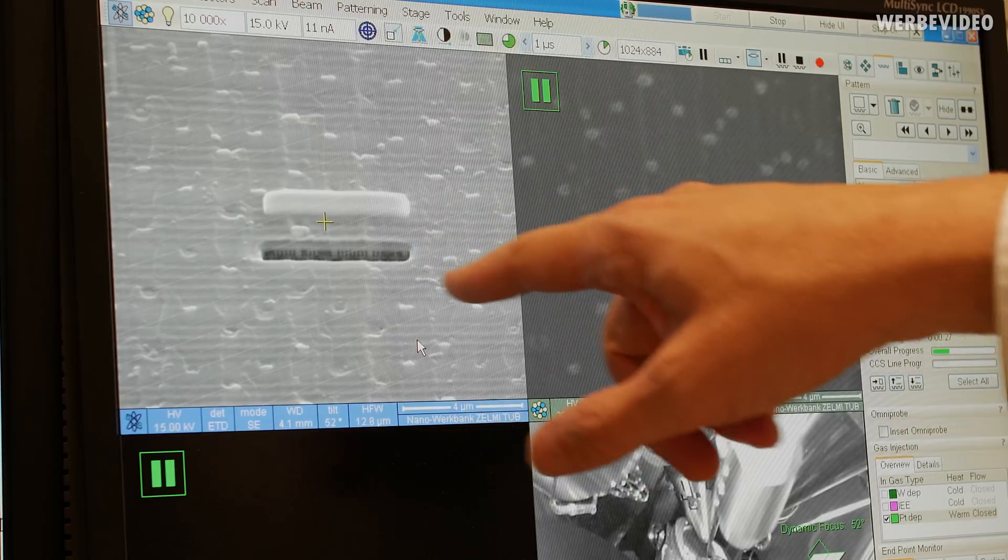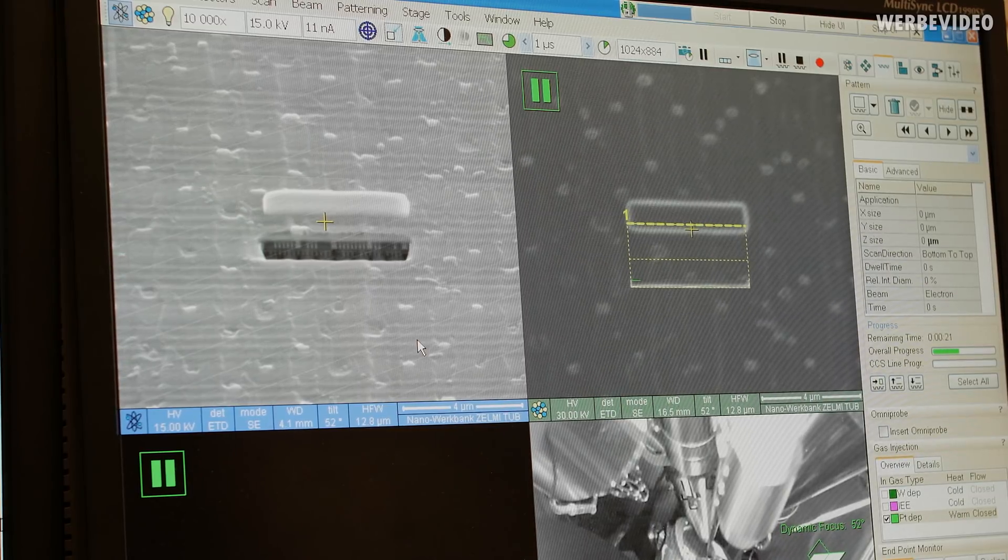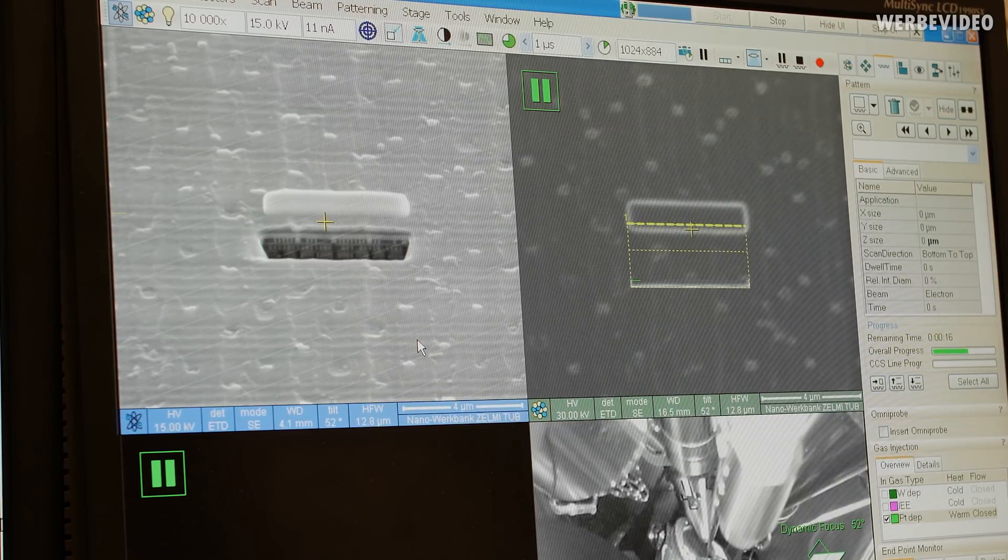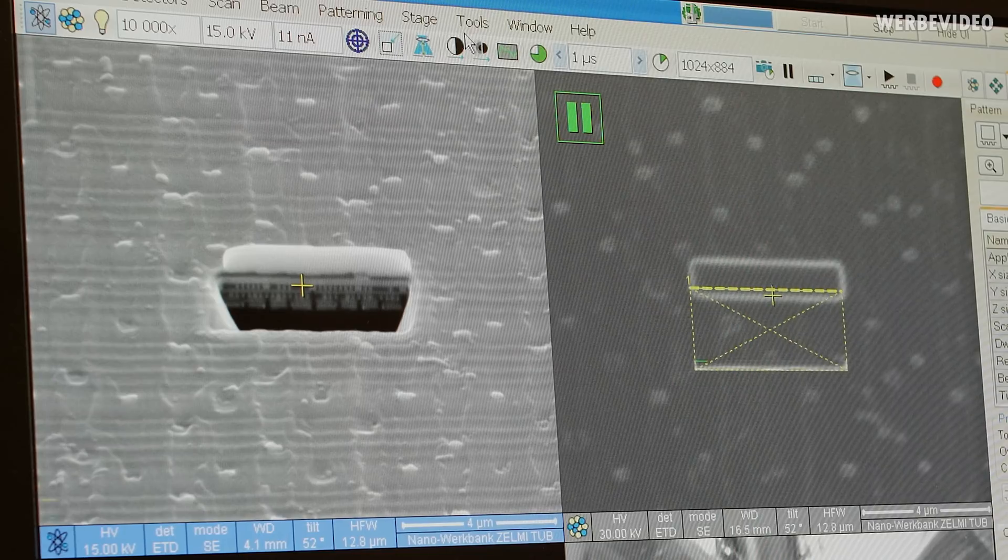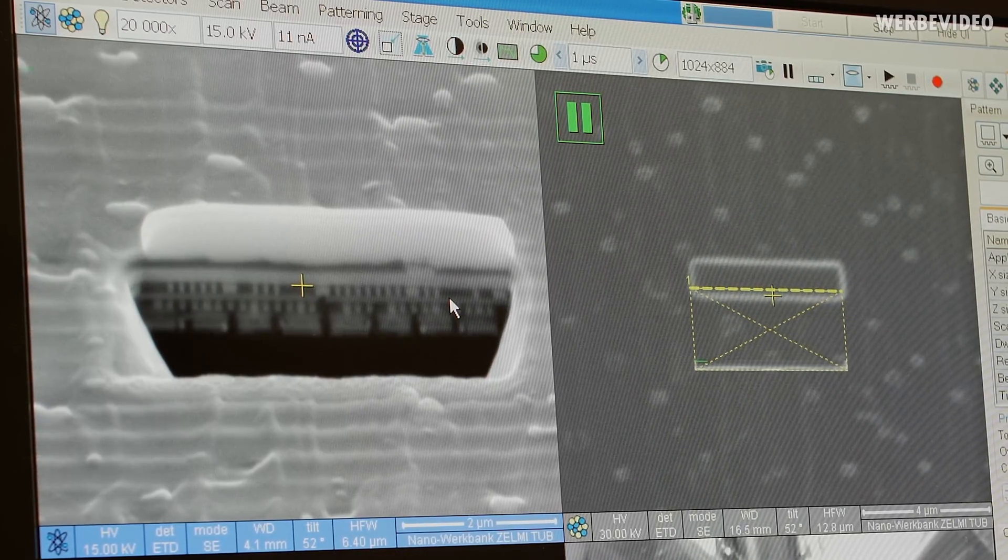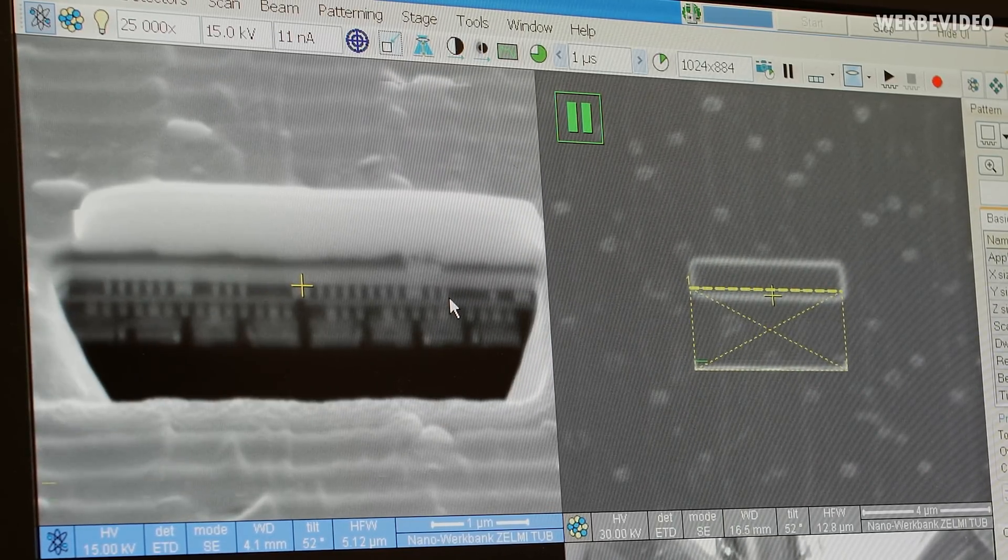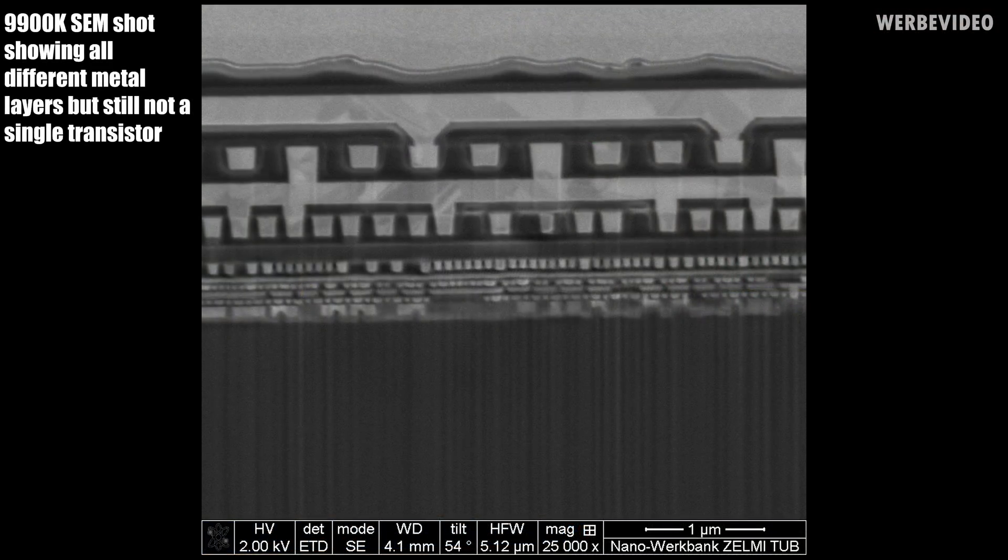And now we're ready to start this process. And what's happening now is that the ion beam is going along a line here and the line is slowly shifted forward. And by this, the material here is removed and all these semiconductor structures are released. And as you can see here, it's a very fast method to see these structures, the depth distribution of these structures. But unfortunately, the resolution is not high enough to resolve all these transistor structures inside of our specimen.